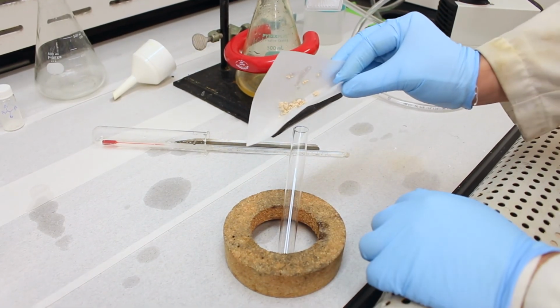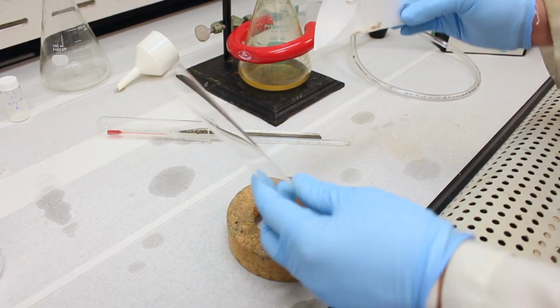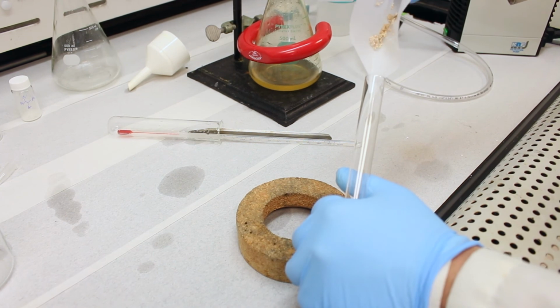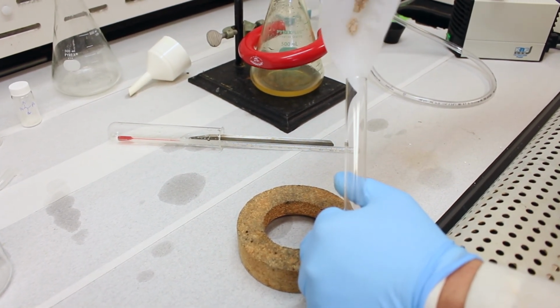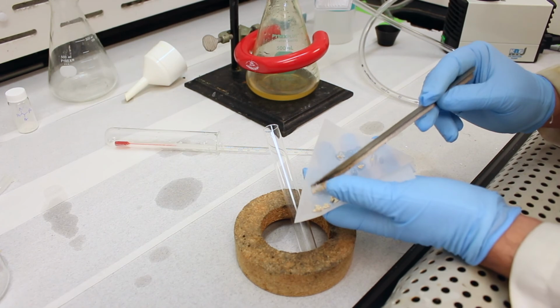Okay, so we've got our crude crystals of diphenylacetylene here, our product, and I'm going to transfer them to this test tube, and this test tube is what we're going to use to recrystallize it. So instead of doing it in a beaker, we'll do it in a test tube. It'd be kind of convenient if it would cooperate. So the crystals are still fairly wet, so it's making it a little difficult to transfer.